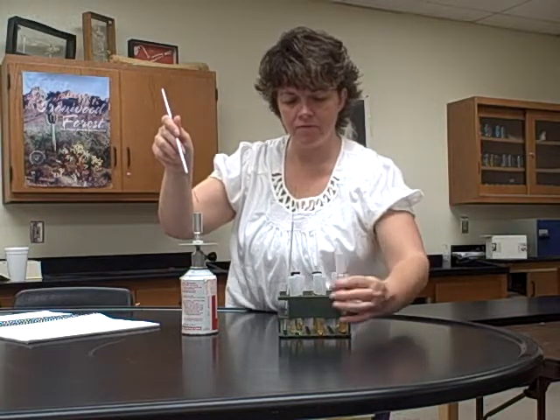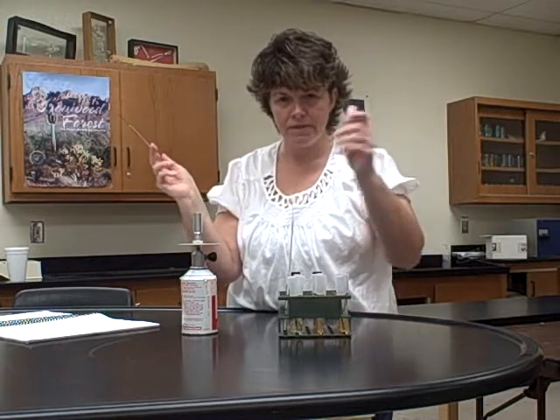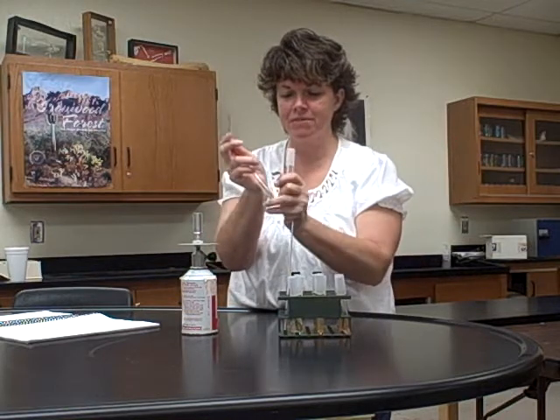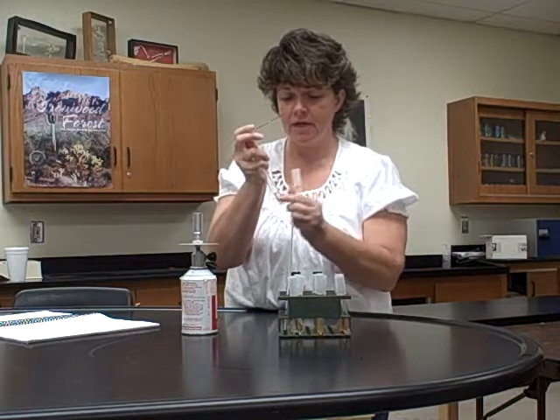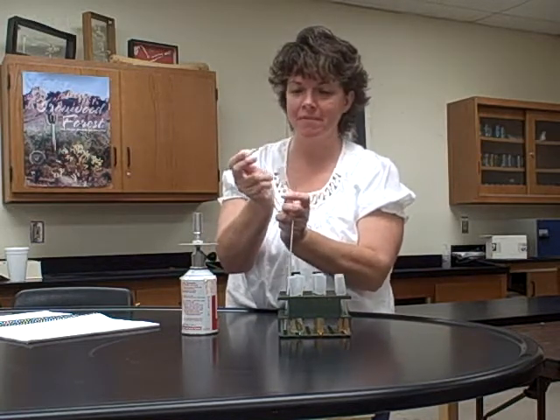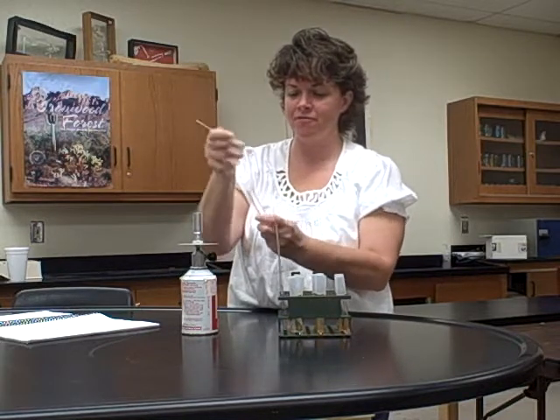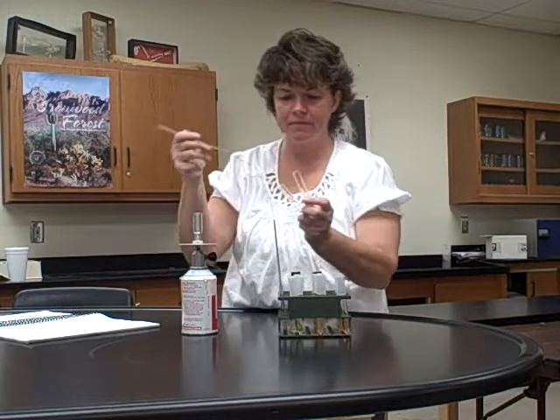Okay, now that's the one I just finished. All right, so I'm flaming my loop, it's cooling off. Once again, I'm going to pick up my culture. Then I'm going to pick up the slant next, because you're still going to use the loop for the slant. Okay, so then I have my culture and my slant that I'm putting into. I've already sterilized my loop, so now once again, I'm going to pull them off with my fingers. Never ever set your lids down. I'm going to flame them.